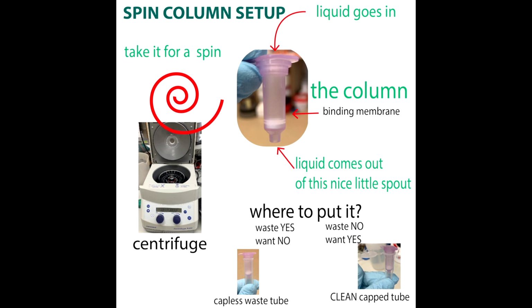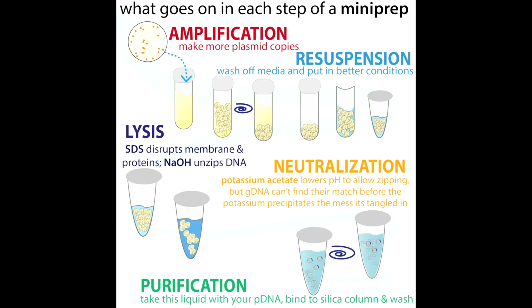So when you do this, the purification process takes advantage of the fact that the bacterial chromosomes, the bacteria's own DNA, is a lot bigger, and so it's not going to be able to recover itself during the purification process. It's just going to clump up, so you won't have to worry about it, and you should just end up with the pure plasmid once you purify it out.